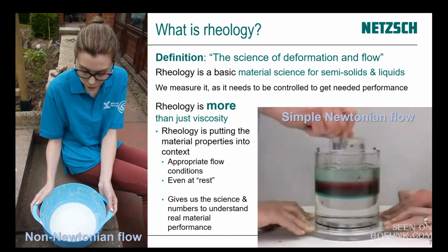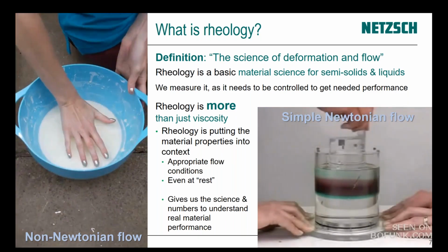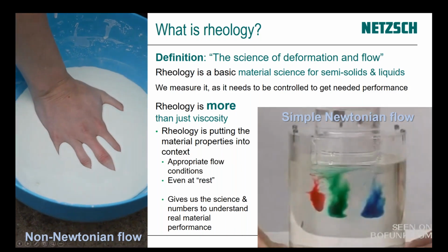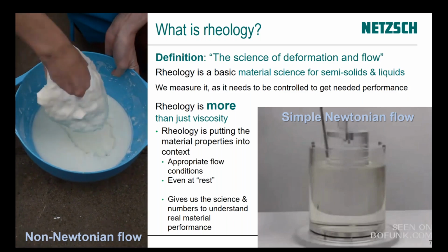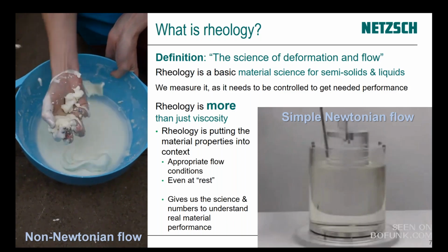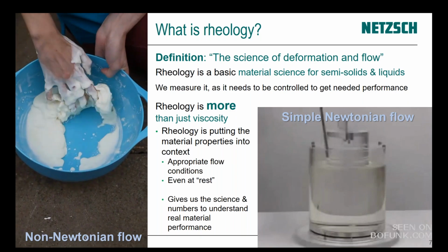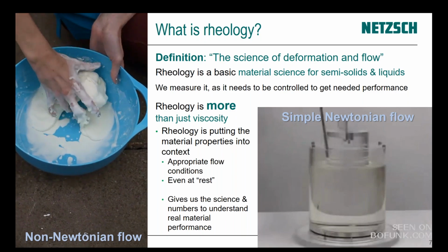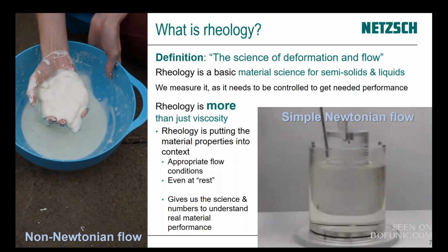Curing, for example, is classic. Yes, by all means, we start off with a viscosity. We start off with a liquid-like material. We can even consider some simple epoxy systems starting off as simple Newtonian flow, the simplest flow behavior there is, which is what the video in the bottom right-hand corner is showing you, how we can have reversible flow with a very simple material. But then as materials cure, as they gel, you're going to get more structure and more rheology. That's the idea of the picture on the left-hand side, showing just how stiff and solid-like the material can get, and especially with curing, that's going to be massively stiff.